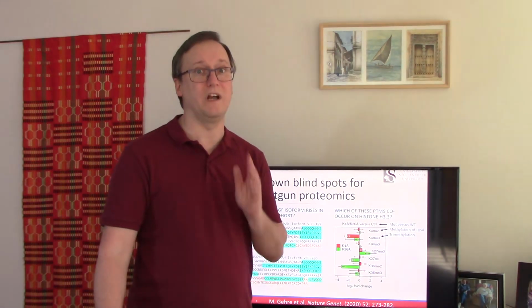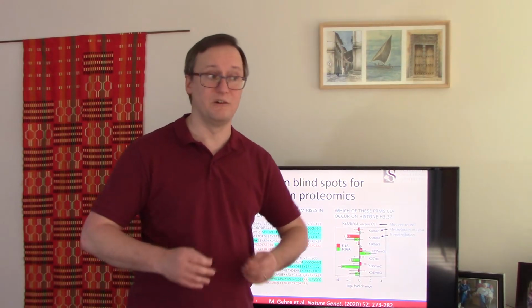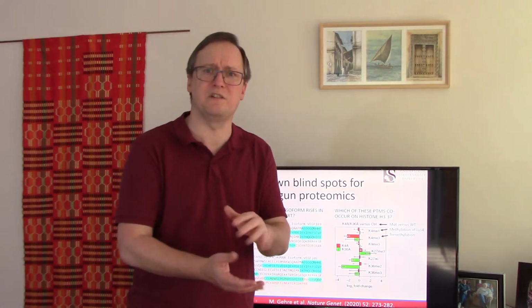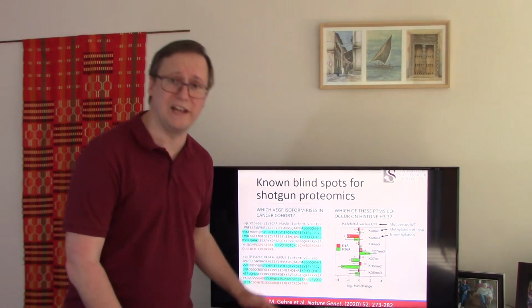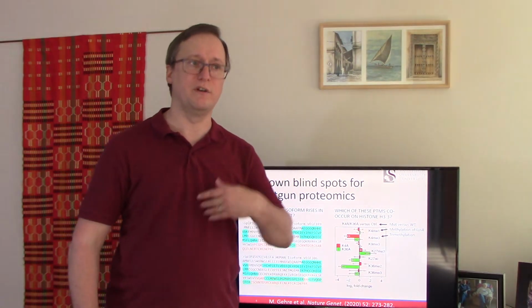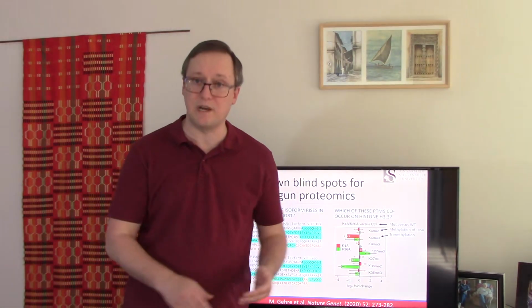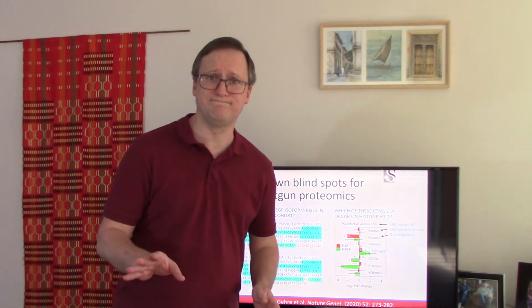This is an area where a lot of bioinformatic toolkits for understanding proteomics datasets really fall apart because we're generally focused on just trying to produce the shortest protein list possible to explain all the peptides we've seen. So that's a big challenge for us to be able to say which isoforms are changing in expression from a given gene. If you're looking at the protein in toto, if you're looking at the intact protein by top-down proteomics, that kind of ambiguity is not going to be a problem anymore.